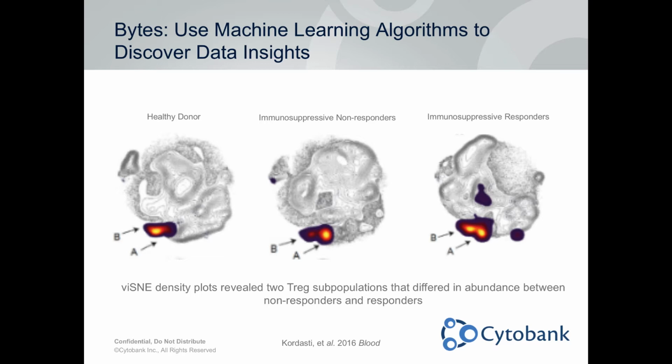The idea in this bytes phase is that these machine learning algorithms are going to help you uncover data insights and aid in data interpretation. Here is a figure from Shahram and Richard's paper, which they'll talk more about later today. They used viSNE as this machine learning algorithm, and it helped reveal a clinically relevant discovery, which they'll talk about.